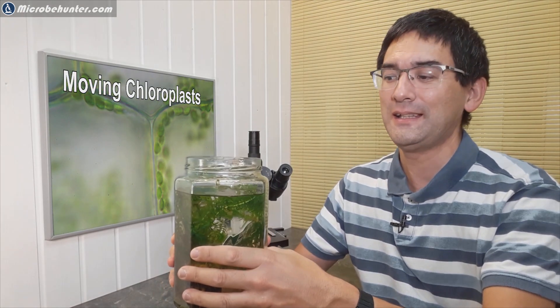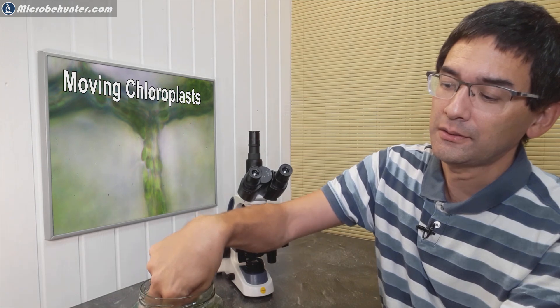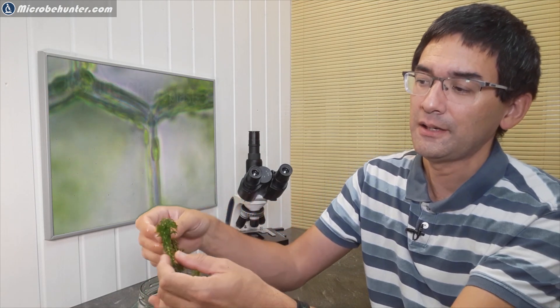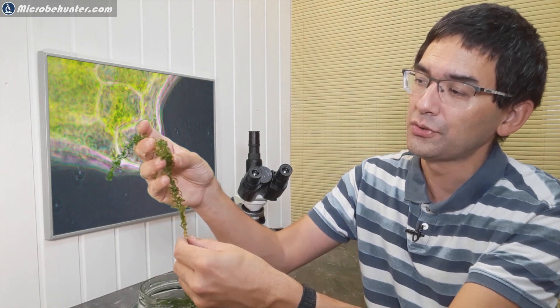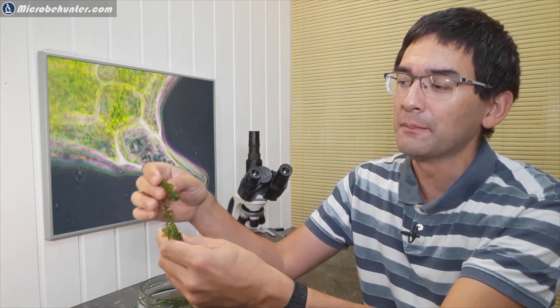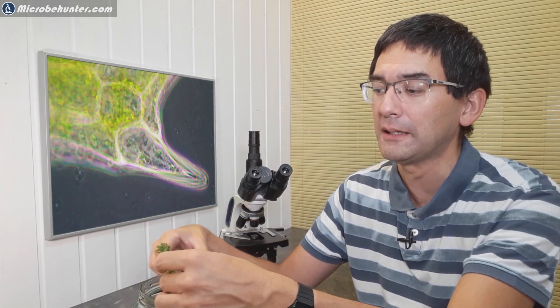So look what I've got over here. This here is Egeria densa, also known as the Brazilian Elodea. It is a water plant. Let me take out one here. It looks like this. It is long and it has roots as well. And it starts to fragment when it's big enough. So it falls apart and it grows quite rapidly.